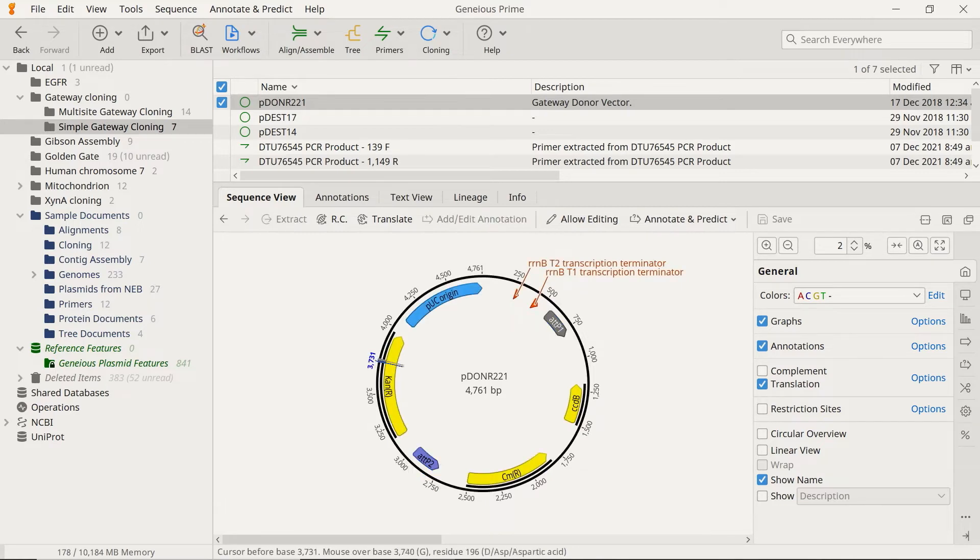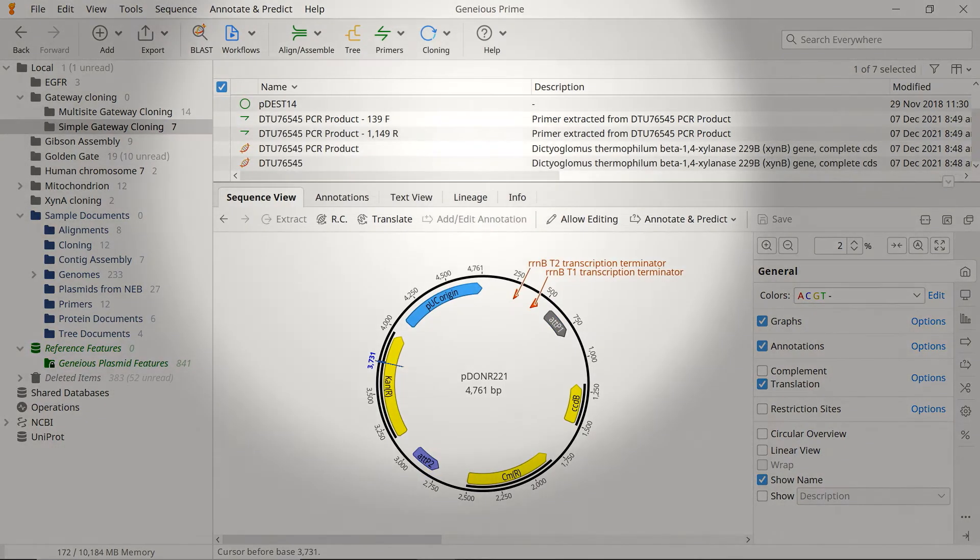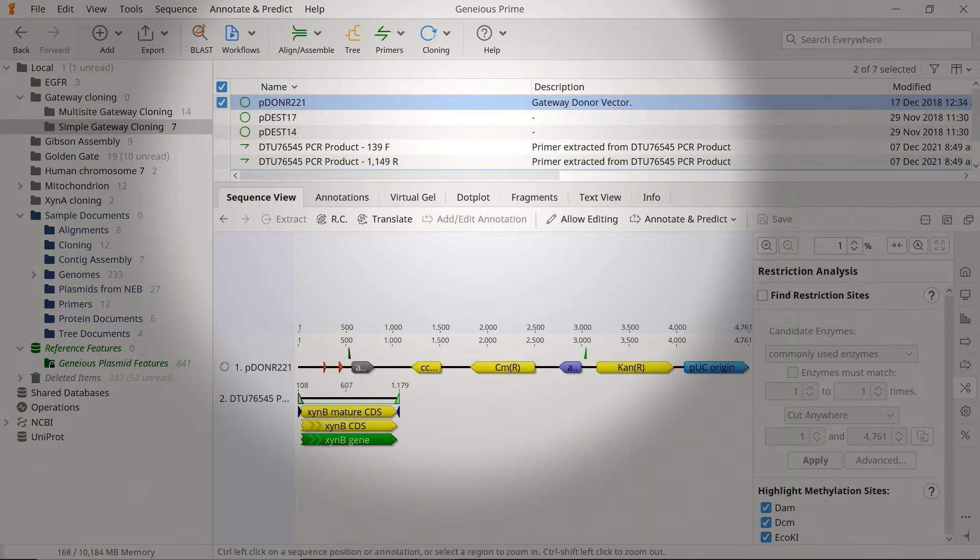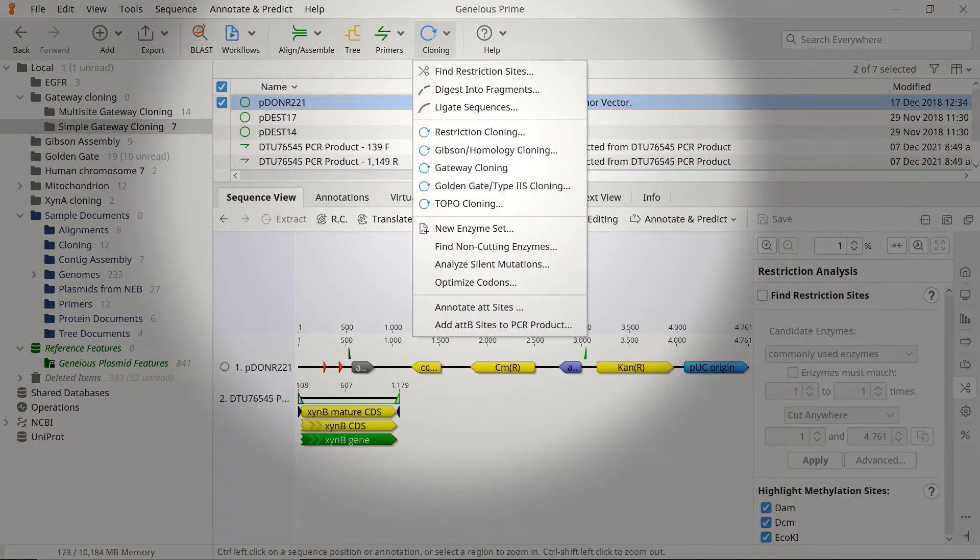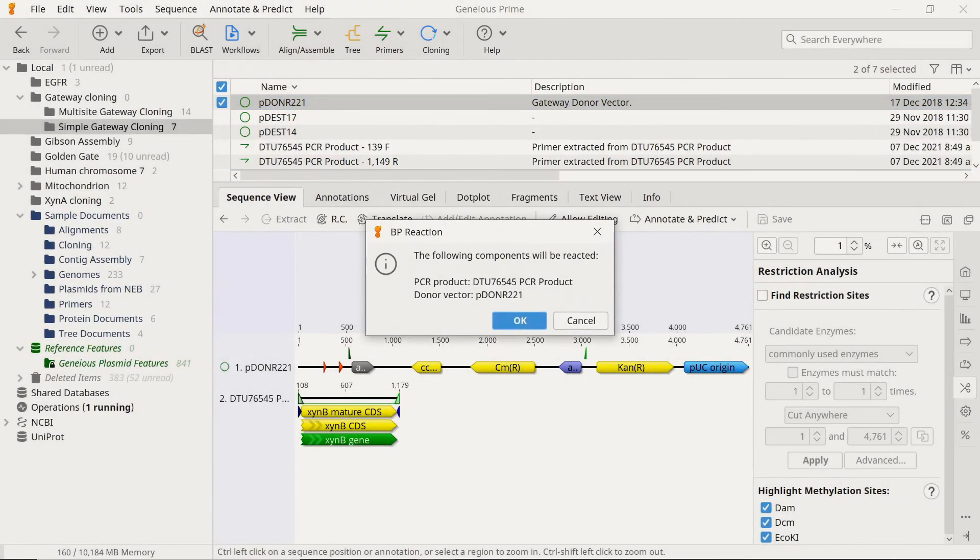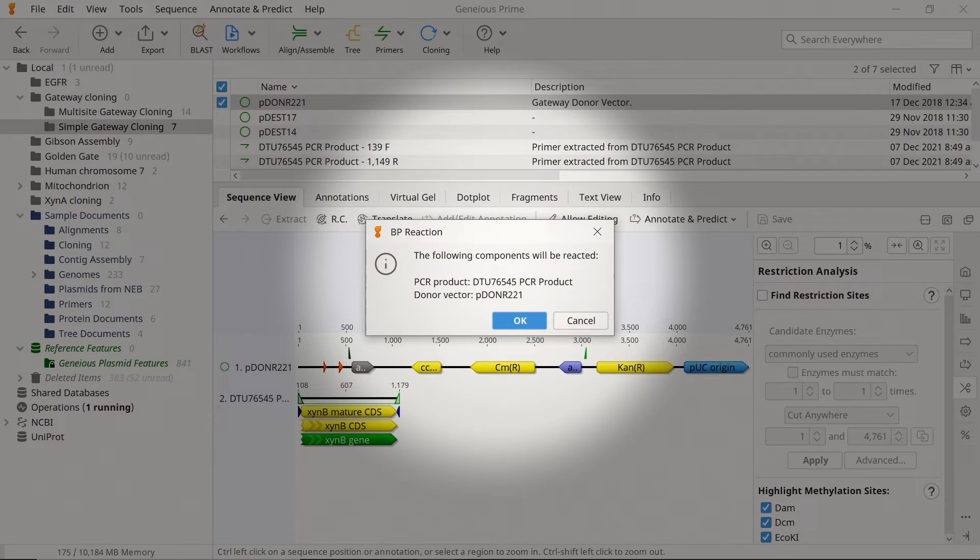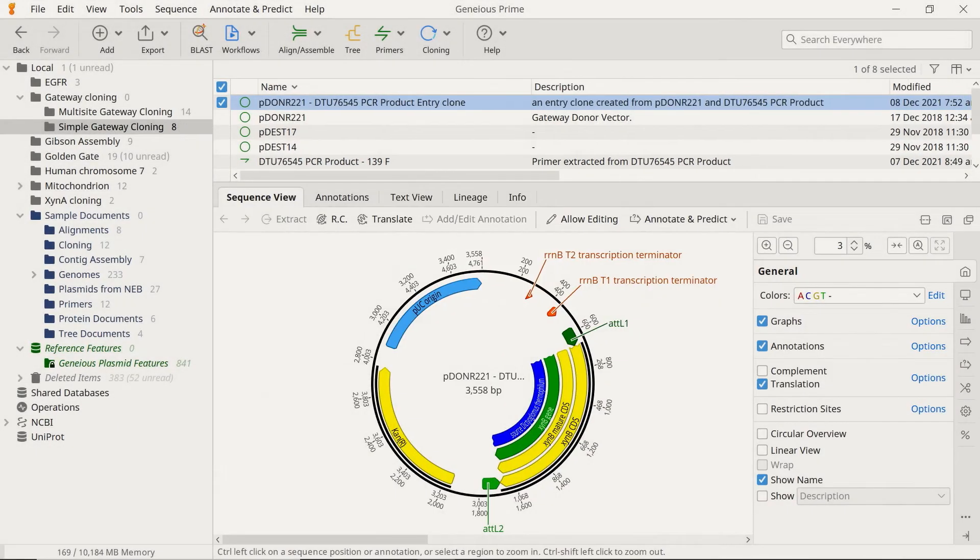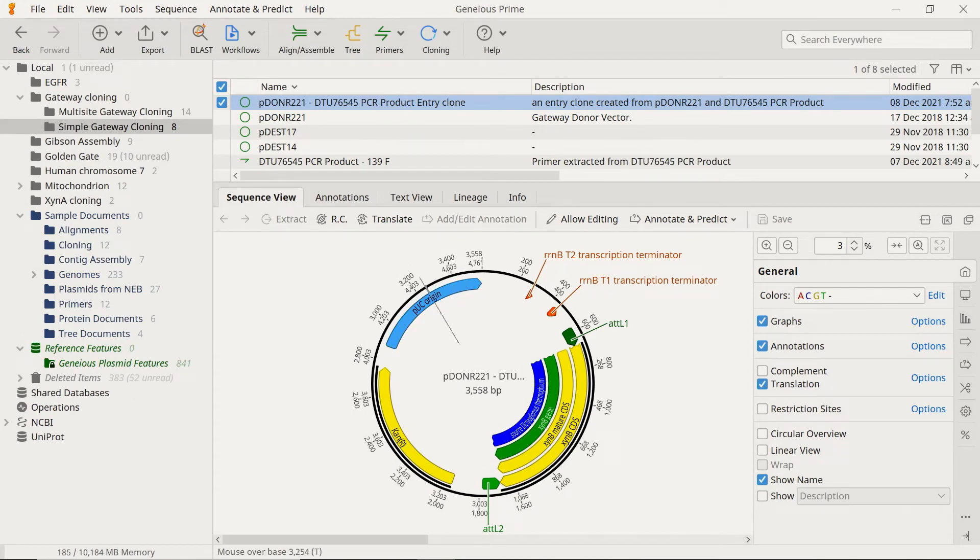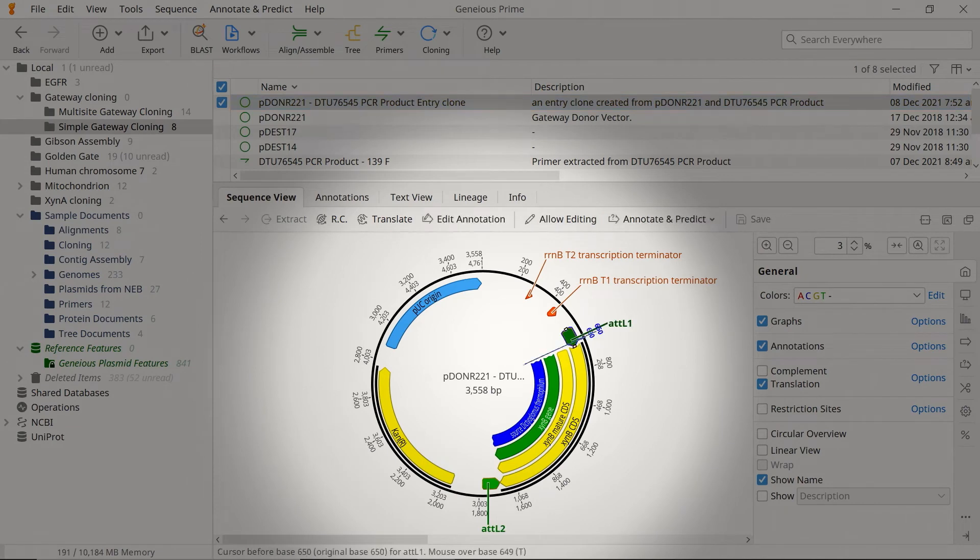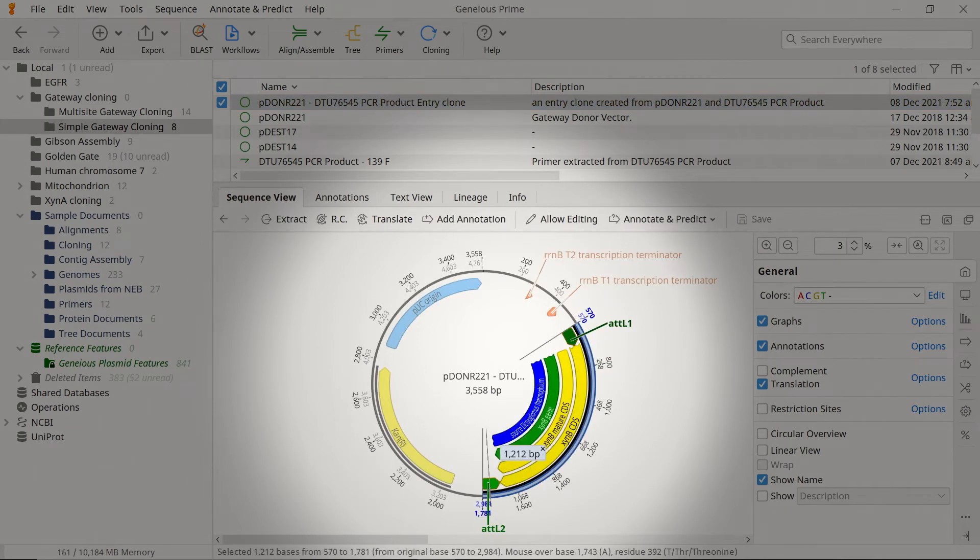To perform the BP reaction in Genius, select both the donor vector and the PCR product sequence files. Then, click Cloning and choose the Gateway Cloning option. Genius will notify you that your two selected sequences will be used in the BP reaction. Click OK to confirm. The result of the BP reaction is an entry plasmid containing the PCR product with flanking attL1 and attL2 sites.